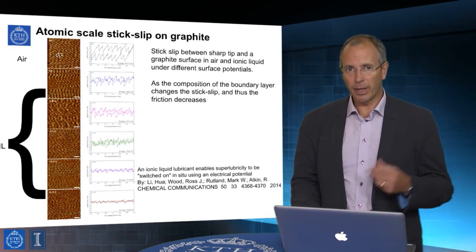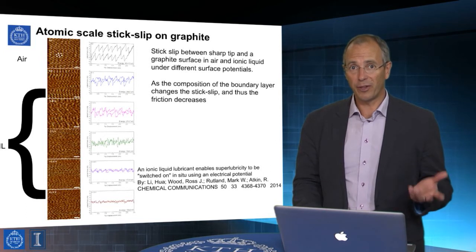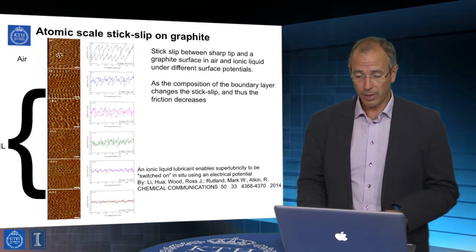So there's a lot of fundamental understanding in the area of friction and tribology that can be generated with the AFM.